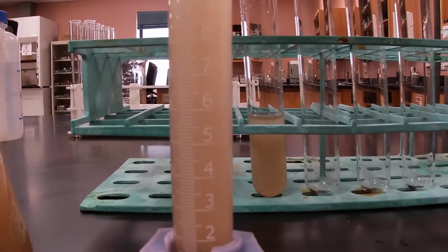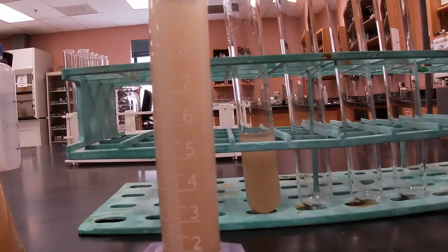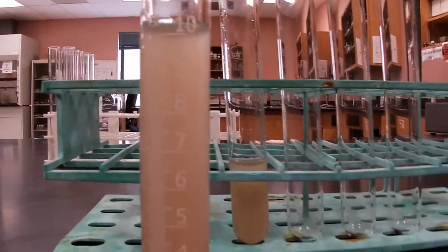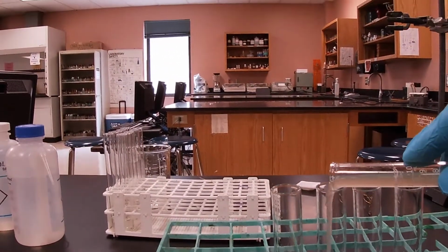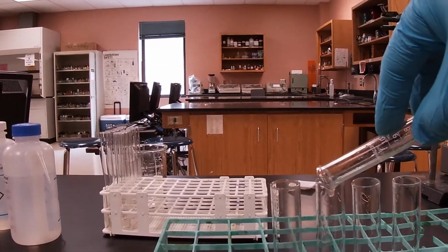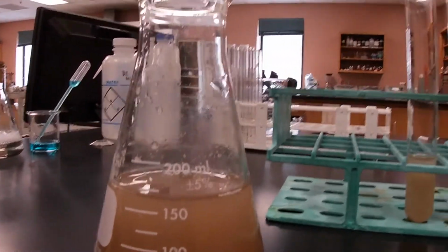Let's see if I can take out some. And I think we're good there. And so we'll go ahead and add it to our second test tube. Okay. And then we'll go ahead and do the same thing.